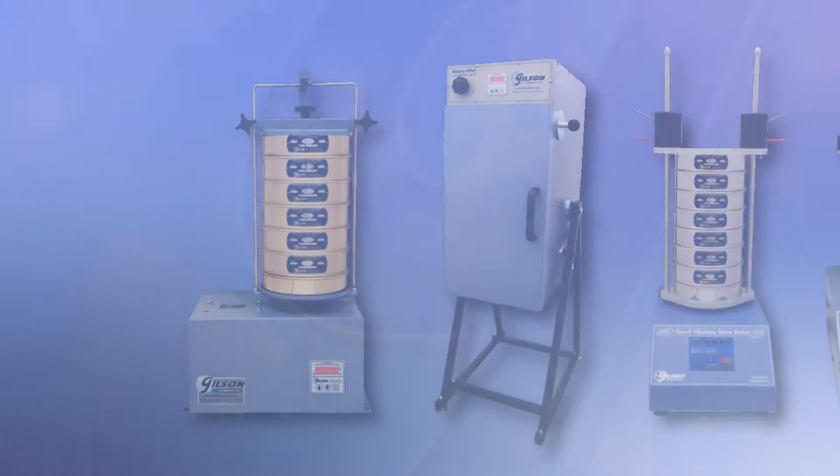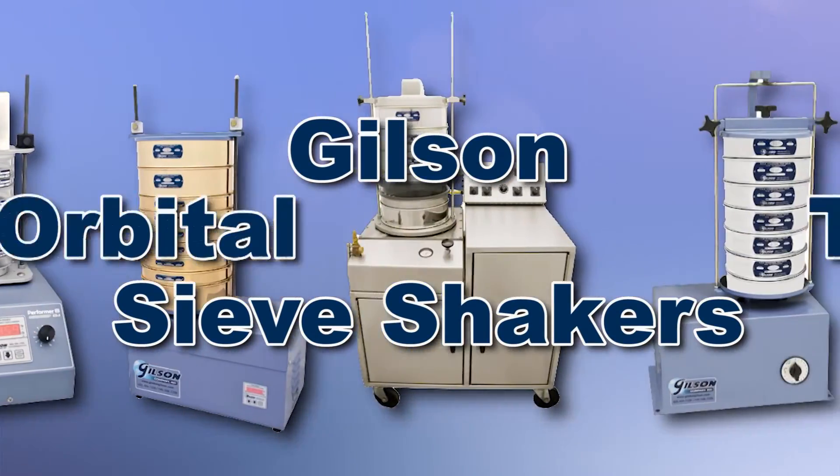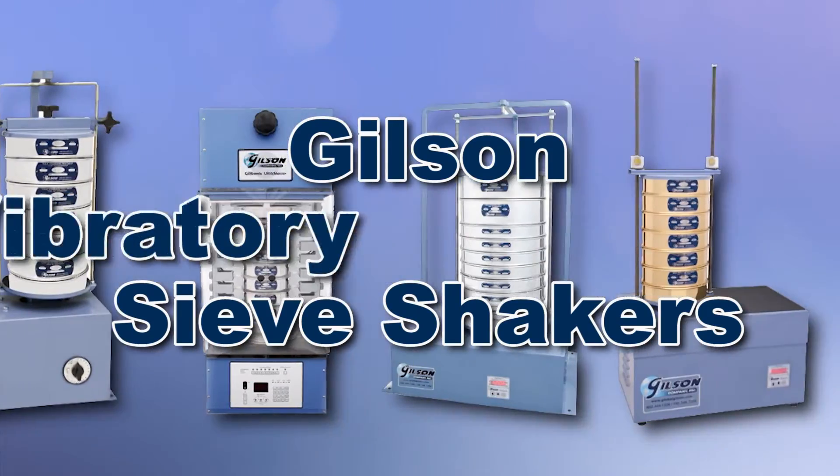With Gilson's complete family of sieve shakers offering a wide range of performance features and capacities, Gilson has the right equipment to fit your needs for accurate sieve analysis.